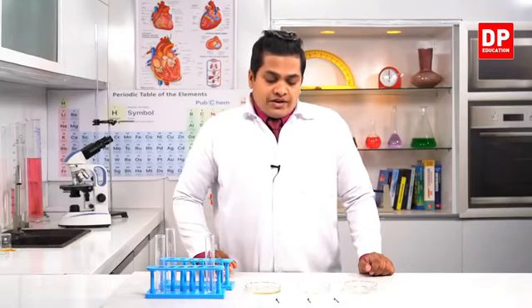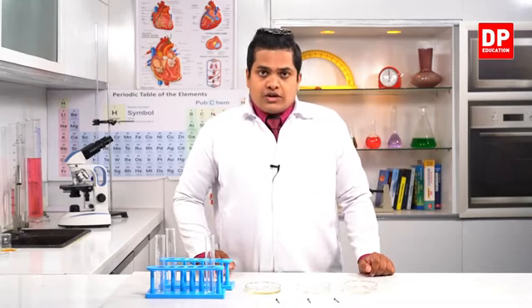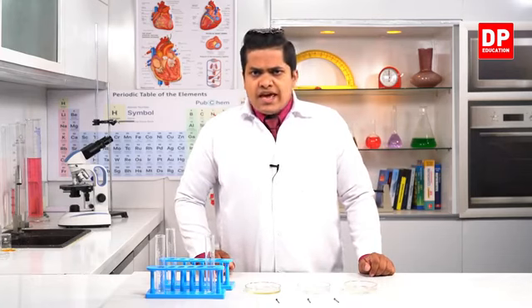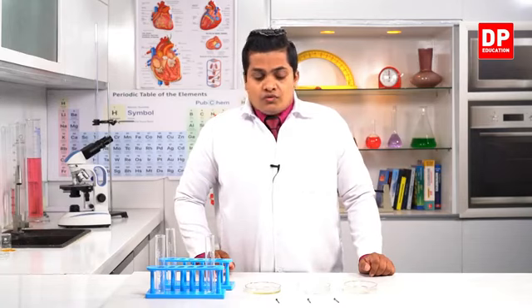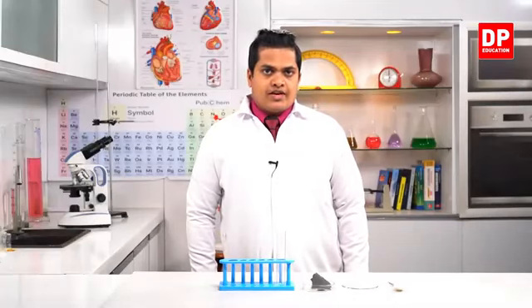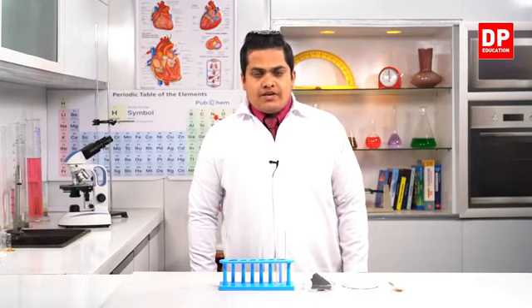So my dear children, let's head on to the classroom once again and we'll write down the observations which we took, and let's see what is the explanation for these kinds of observations. So in this activity we'll be investigating the next factor which is important for the rusting of iron. Here we'll be examining the necessity of water vapor or moisture for the rusting of iron.